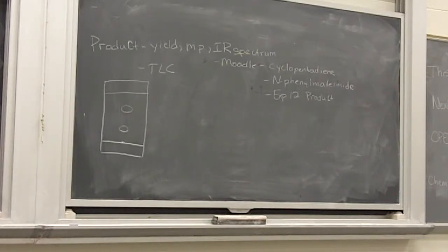You will not be able to create a usable eluent system that would be more polar than your silica, okay? So you can't reverse this scenario by making something that is more polar than the silica itself. Your eluent, if it's something that's going to be reasonably usable for this type of chromatography, will always be some degree less polar than the silica itself, okay?